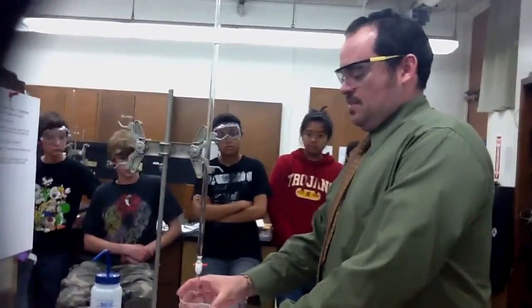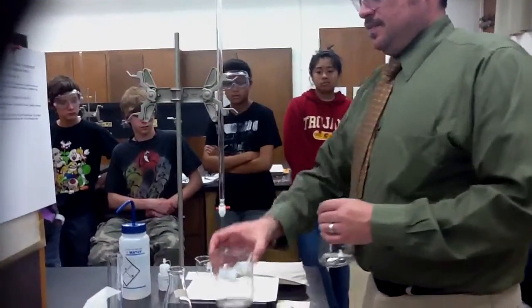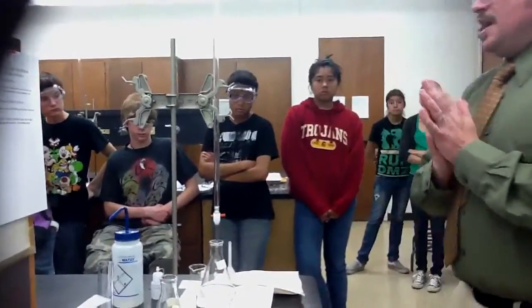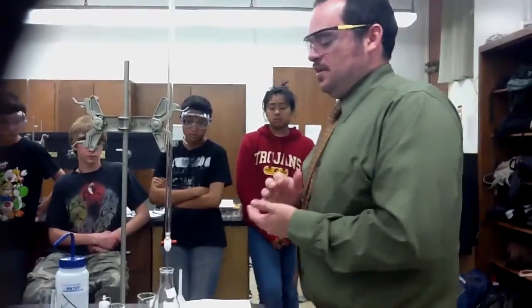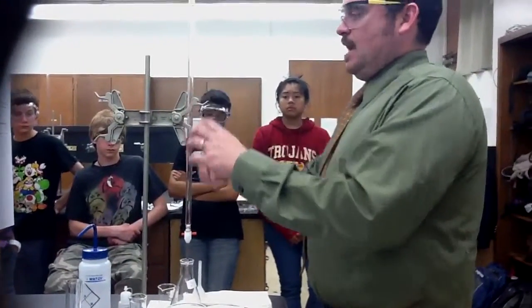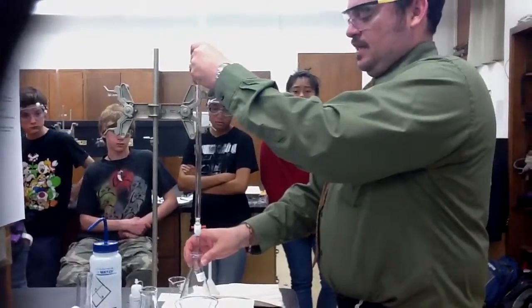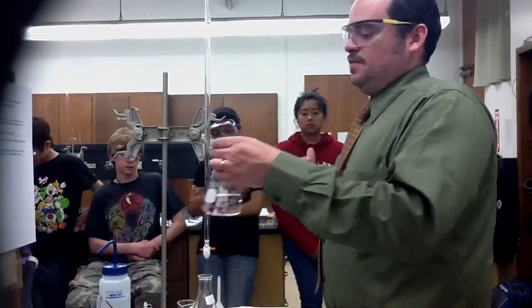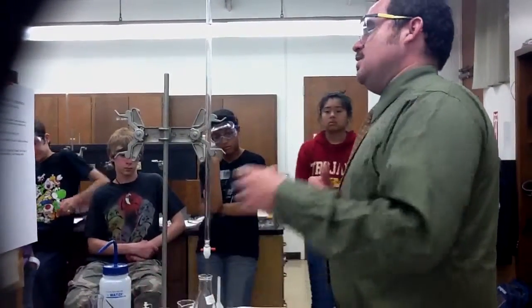So I'm going to take this one away and put right below it the preliminary flask with our acid, the vinegar, in it. At this point, all we're going to do is start stirring this up. Remember, the end point is what you're trying to achieve, also sometimes referred to as the equivalence point.